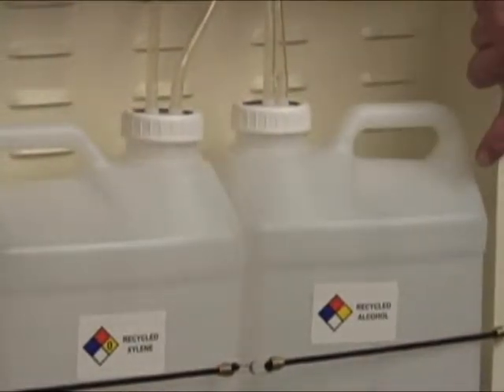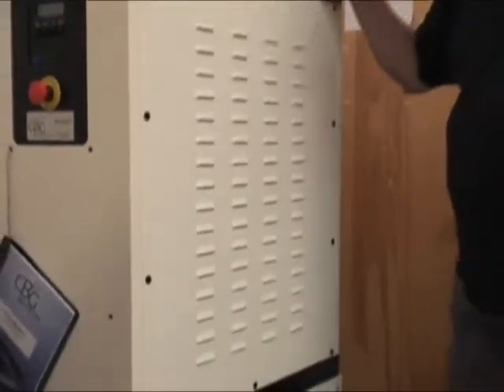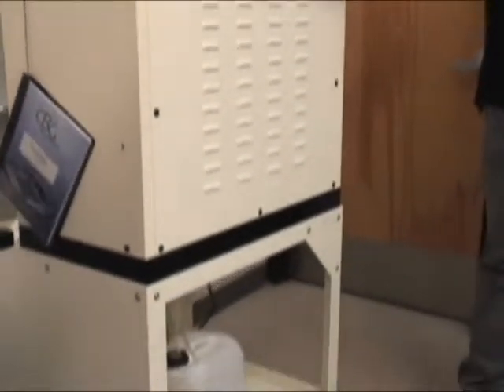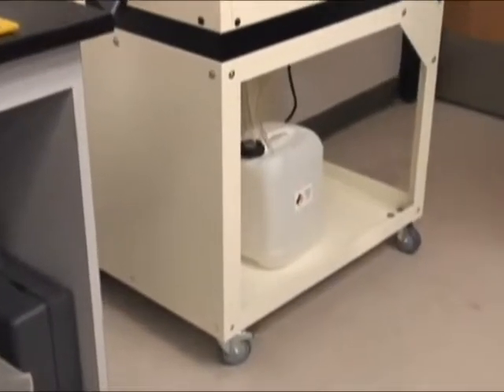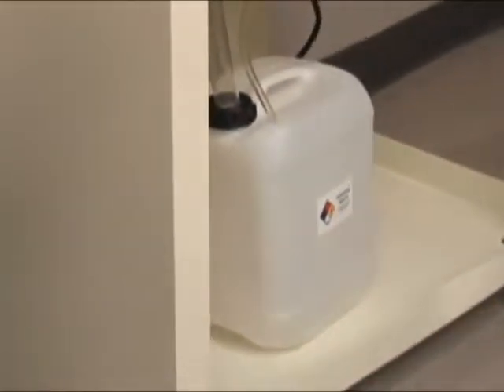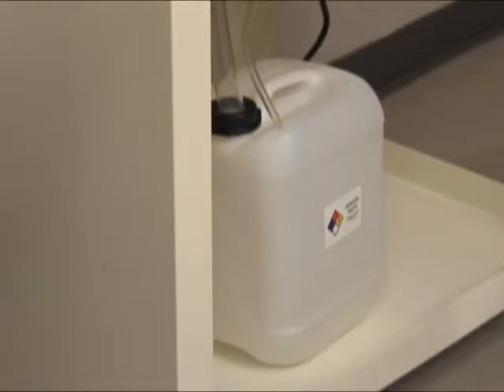Somebody get me that alcohol container up there. The other change we're going to make is this. This is your paraffin waste container — that's where the paraffin is going to go. We don't want alcohol to go in there. We want just paraffin to go in there so it solidifies.